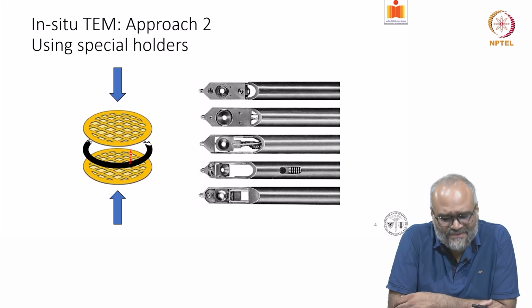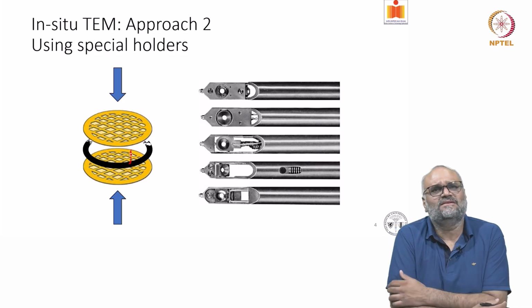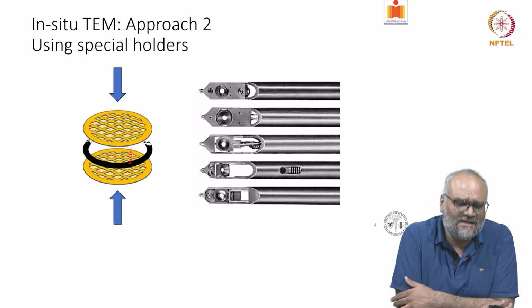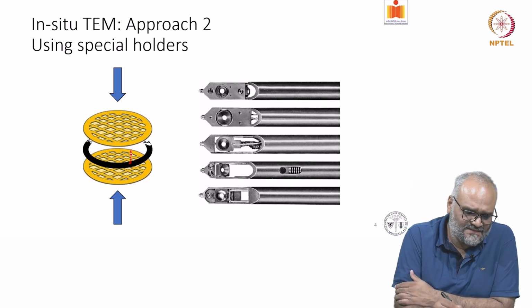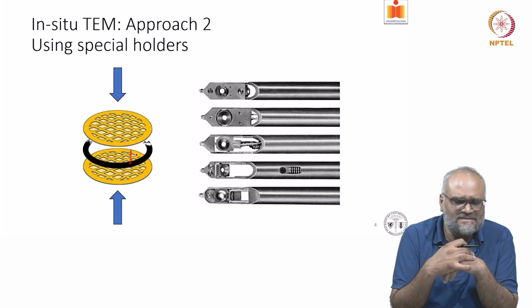as 1970s only. And the idea is you form a kind of a couple of these membranes together and you sandwich them, and then you can isolate this from the rest of the microscope vacuum and you can see changes inside the material.